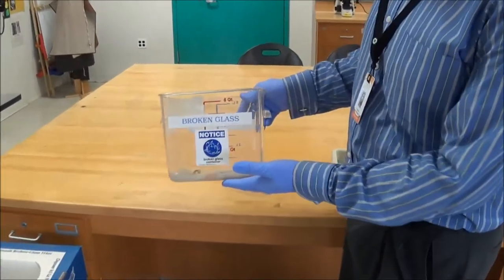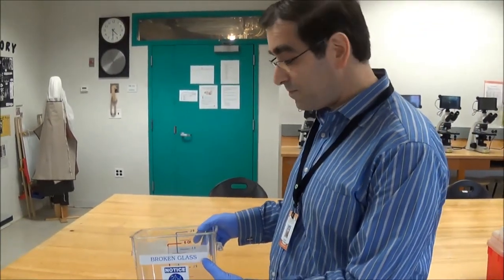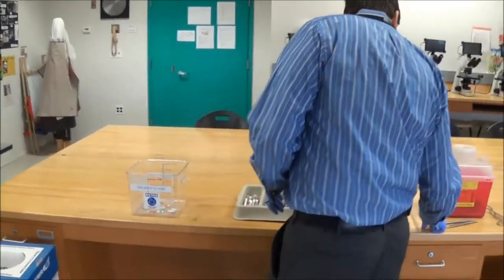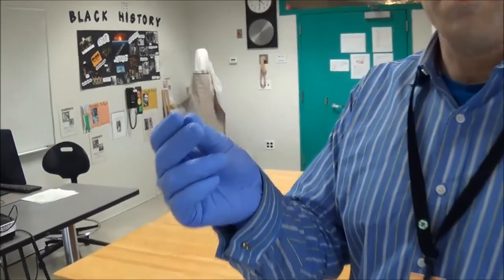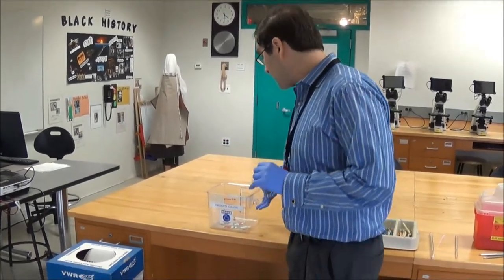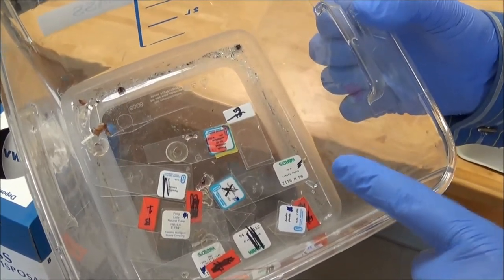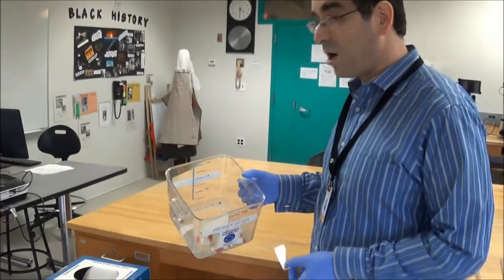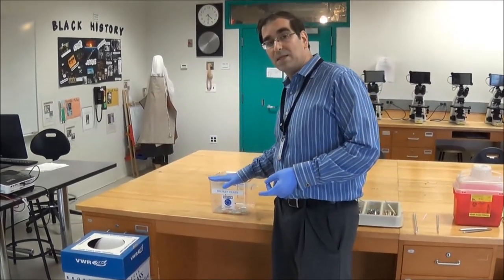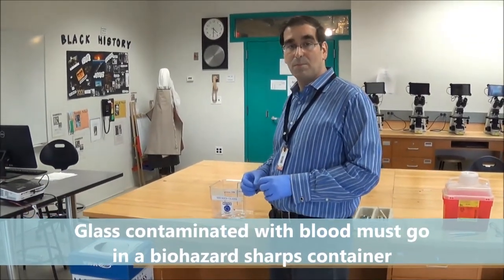On the other hand, you're going to find other containers marked 'broken glass' or 'broken slides.' In these containers specifically, we put our glass slides. There are two types of glass slides you'll find: ones where you'll make the specimen yourself, and ones that come from a company with labels indicating what the particular item is, sometimes with a color-coded and number-coded system. It's very important that glass slides end up in this type of container so we can identify what slides have broken and replace or potentially repair them.